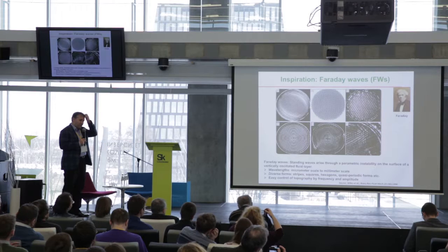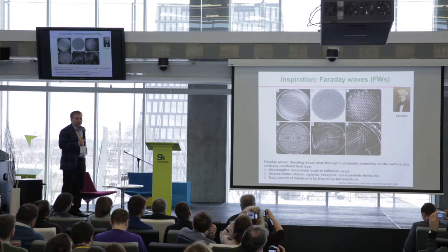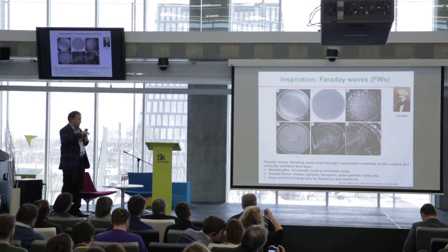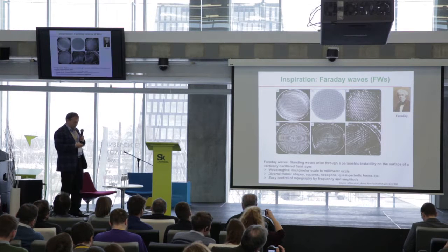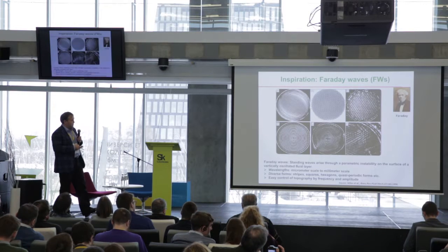When I gave a talk here a while back, there was a question from the audience about assembling acoustics in the Z direction, and I said we were working on it, so I'll show you some of those results as well, how we can make multiple layers by standing waves in the Z direction. But first, to talk about Faraday and Faraday waves.